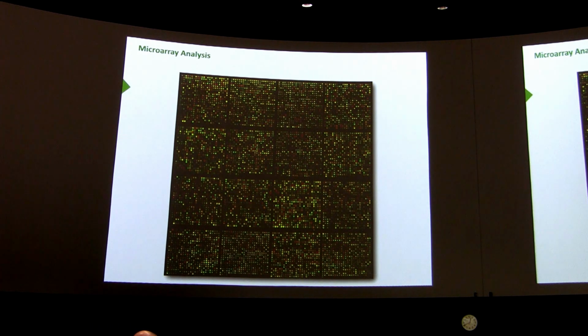So it can tell us very good quantitative information about the relative amounts of each of those. And since it knows the identity of each protein, it can give a profile of that cell. You might tell the computer program, okay, what enzymes of glycolysis, are they affected by this? And so the computer program would go back and it would say, okay, here are the enzymes of glycolysis, here's the information, and you could see that 3 of the enzymes of glycolysis are elevated in the cancer versus the non-cancer cell. All right? Instantaneous information that the computer could pull out for you and tell you about the relative abundance of these. Okay.